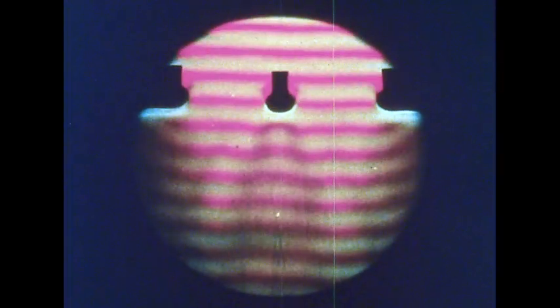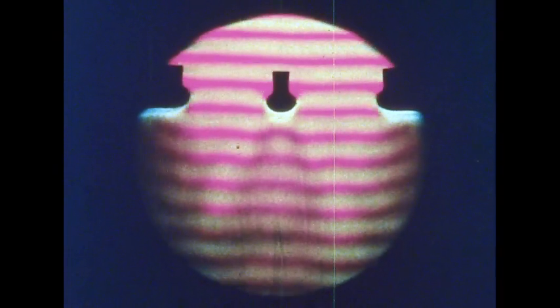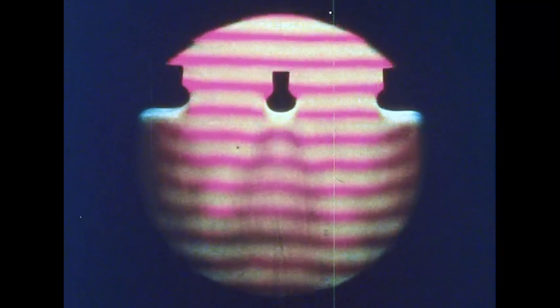Light from a given source has a measurable wavelength. An object whose width is greater than half the wavelength of light distorts the pattern of the wave movement, and so the eye can see it. But a smaller object hardly deflects the wave movement. This means it cannot be seen. To see and magnify such small objects, we must find an alternative to light with a shorter wavelength.